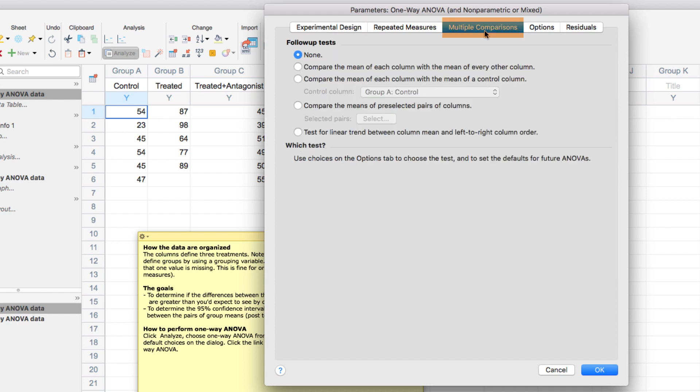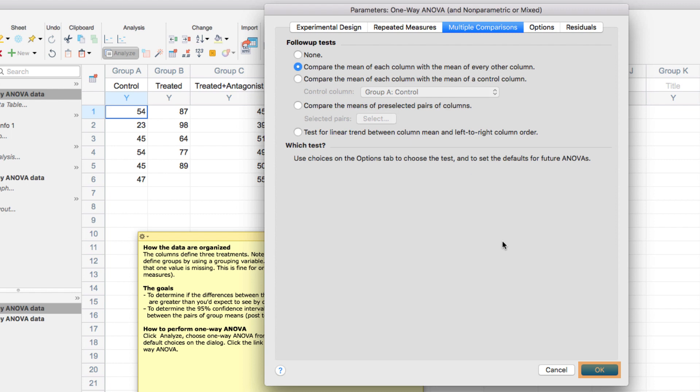To do that, we need to select Multiple Comparisons and define the type of multiple comparisons we'd like to make. We'll select Compare the mean of each column with the mean of every other column, and click OK.